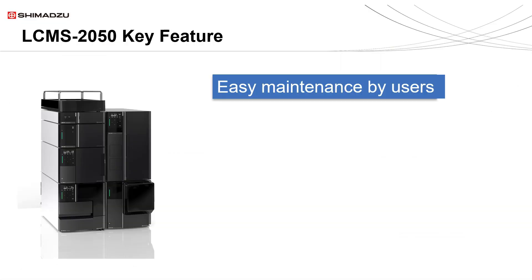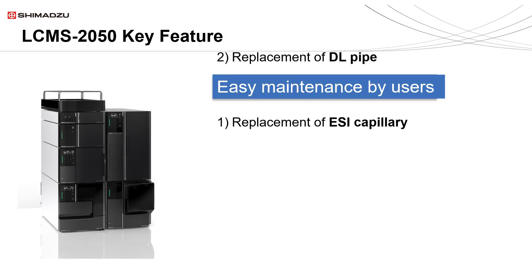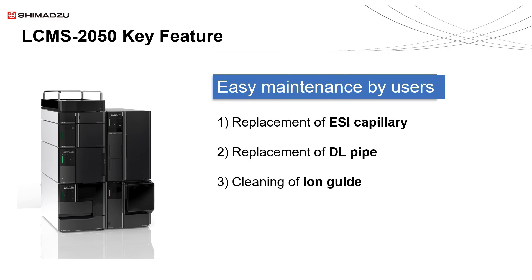There are three parts that can be easily maintained by the user. I'll show you the replacement of the ESI capillary, replacement of the DL pipe, and cleaning of the ion guide.